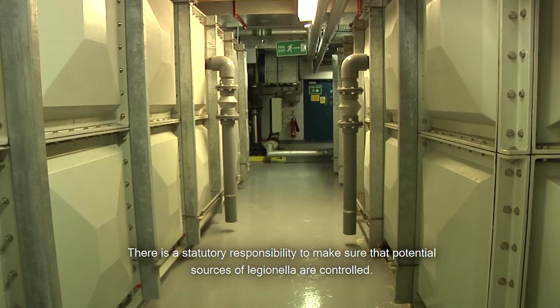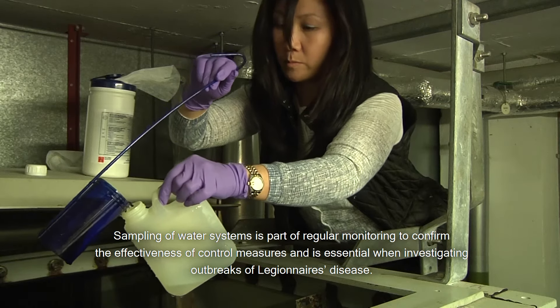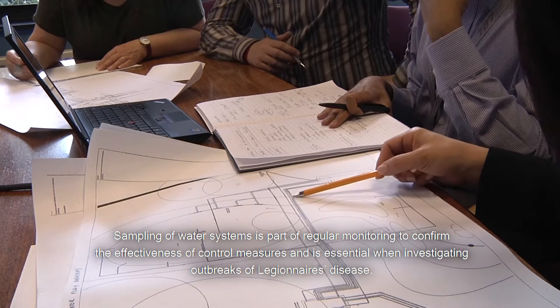There is a statutory responsibility to make sure that potential sources of Legionella are controlled. Sampling of water systems is part of regular monitoring to confirm the effectiveness of control measures and is essential when investigating outbreaks of Legionnaires disease.